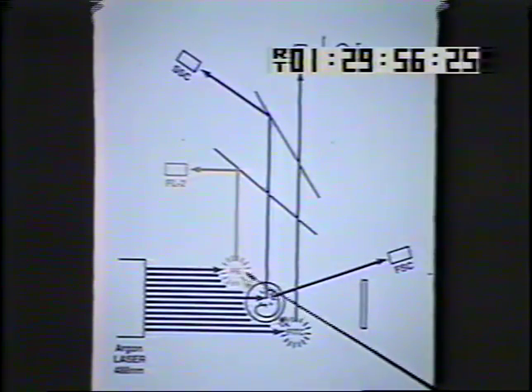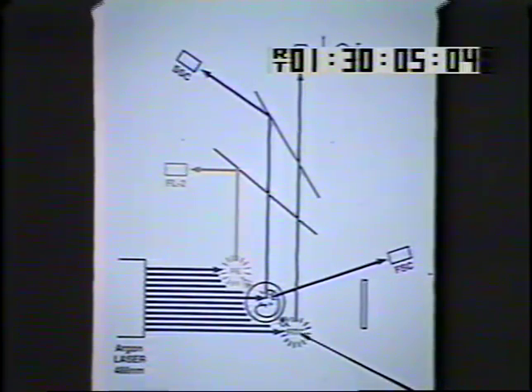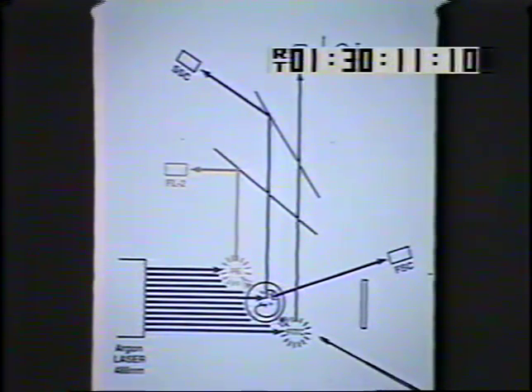And we can see 2 antibodies, this one right here in orange and this one right here in green, which are giving fluorescence signals related to the presence or absence of proteins on the cell surface. So this is really the heart of what's going on in a flow cytometer. It's a cell passing through a light beam with multiple optical measurements being made simultaneously.